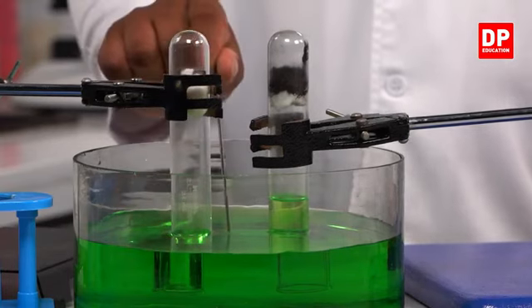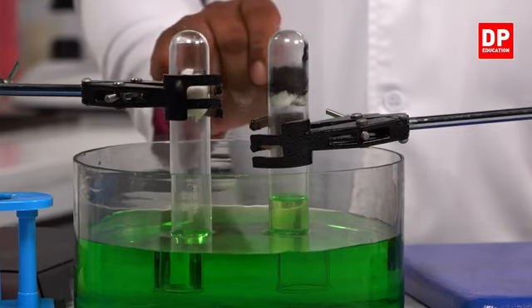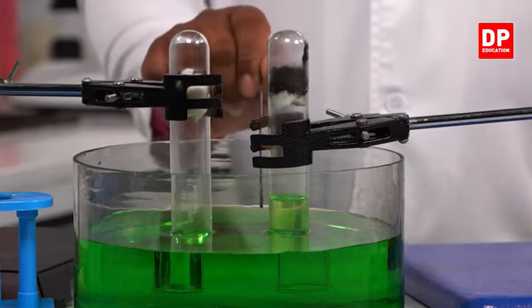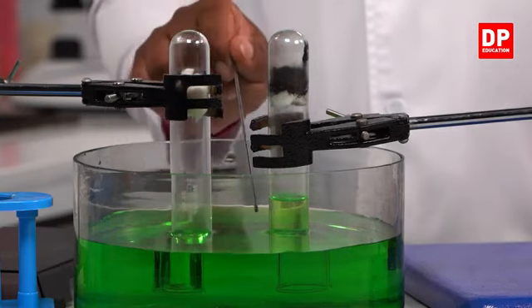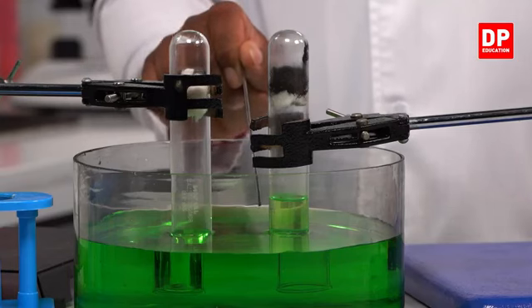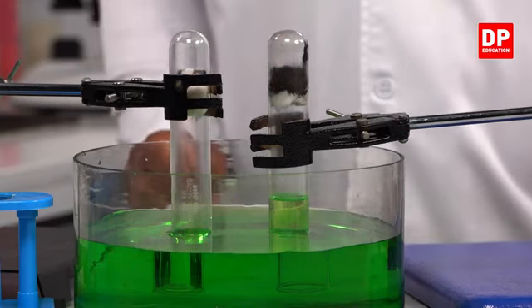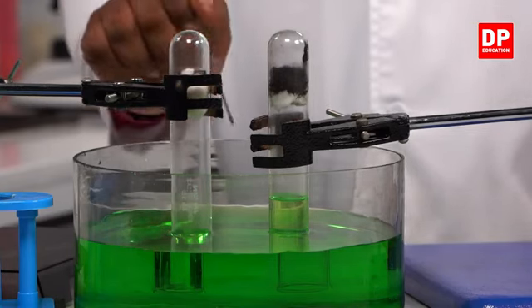So out of those 5 parts, 1 part is colored water. This is the part which the water has risen up, and it is about 1/5 of the entire volume from here to here.